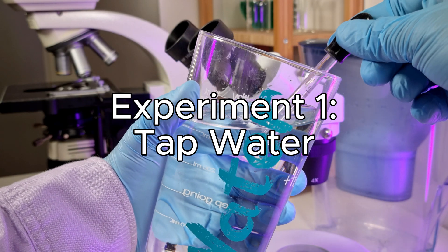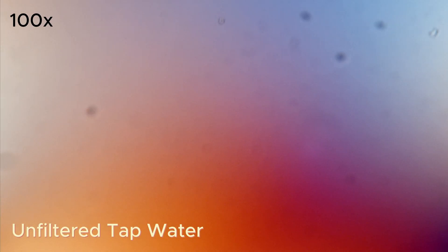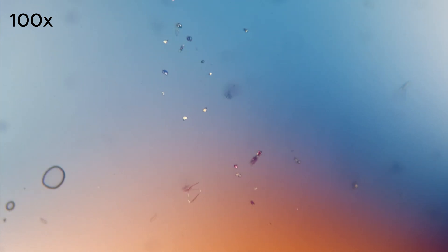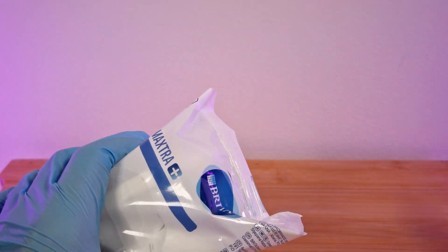Let's keep this in mind as a reference for our first experiment with the tap water. It's important to note that in Germany tap water goes through a filtration process and is considered safe for drinking. However, there are many factors that can impact its quality. At 100 times magnification we can immediately observe the presence of tiny particles moving in the water. Although some of them may originate from the glass, using the dark field filter allows us to observe their movement.